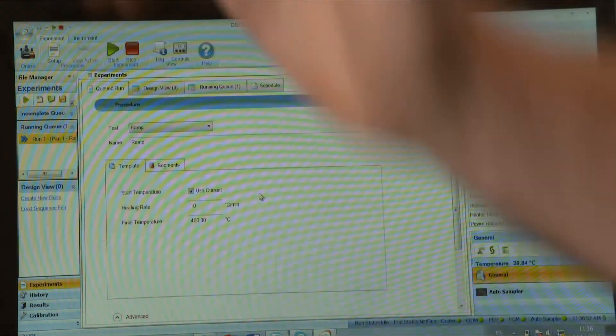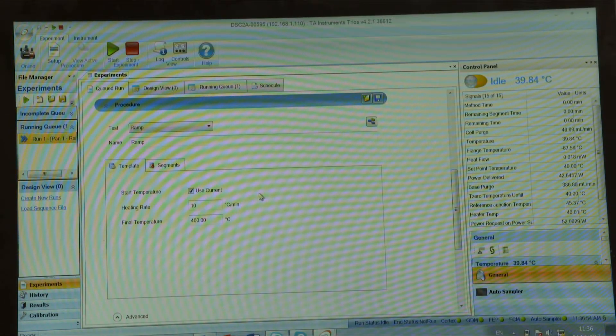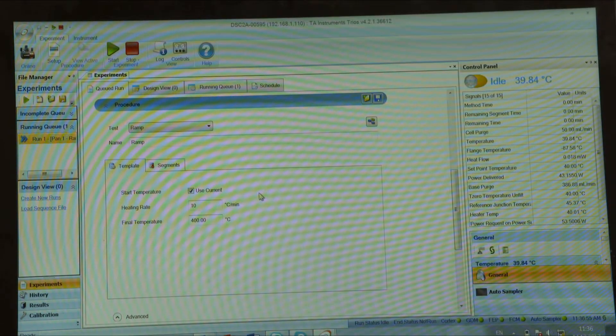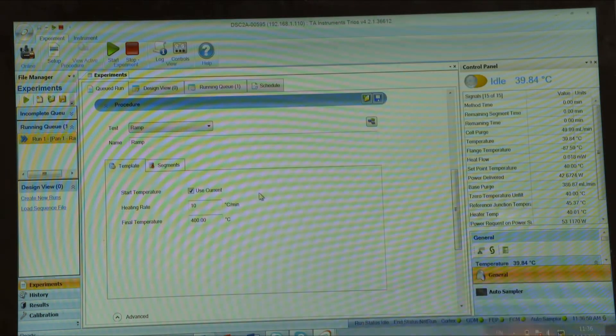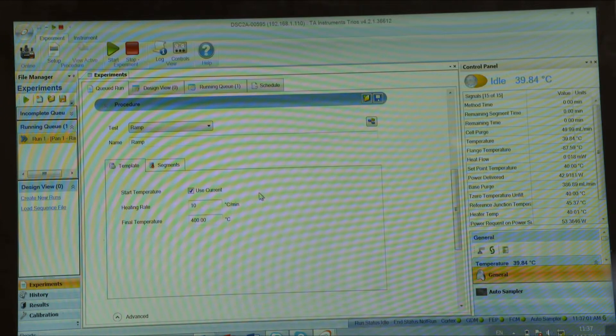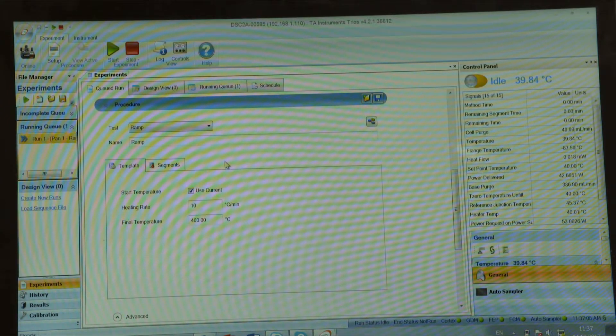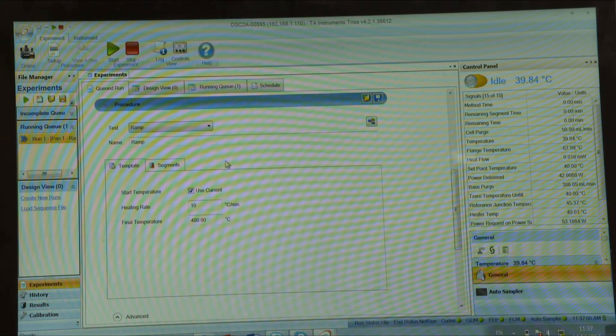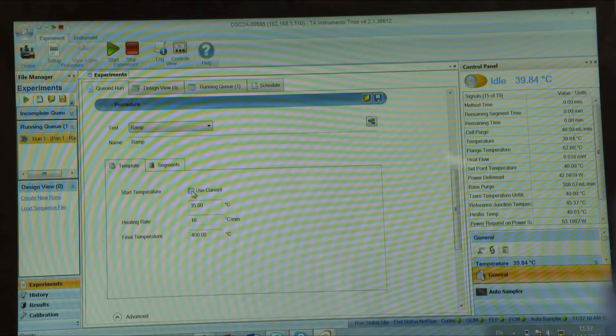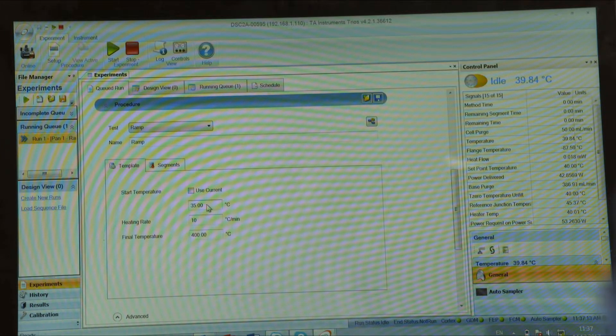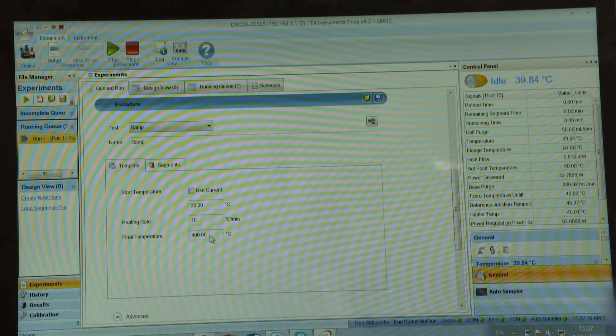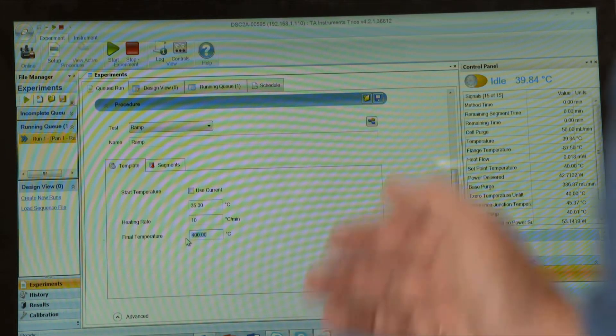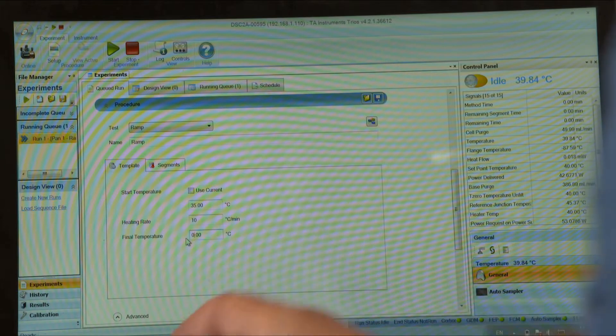The sample which we're going to test today, we anticipate to see glass transition at around 160 degrees. So what we're going to do, we're going to heat through glass transition temperature and see if we could catch anything. So I'm going to start from 35 degrees C, heating rate 10 degrees C per minute, up to say 250 C.